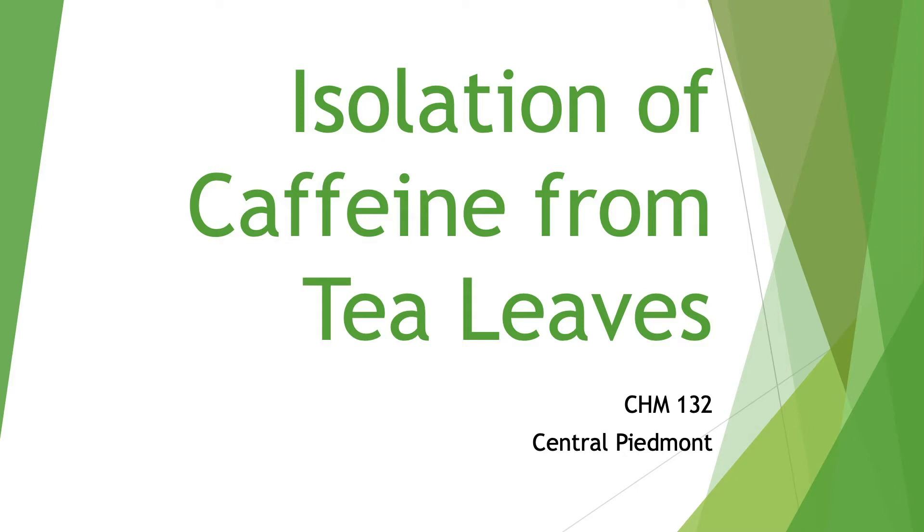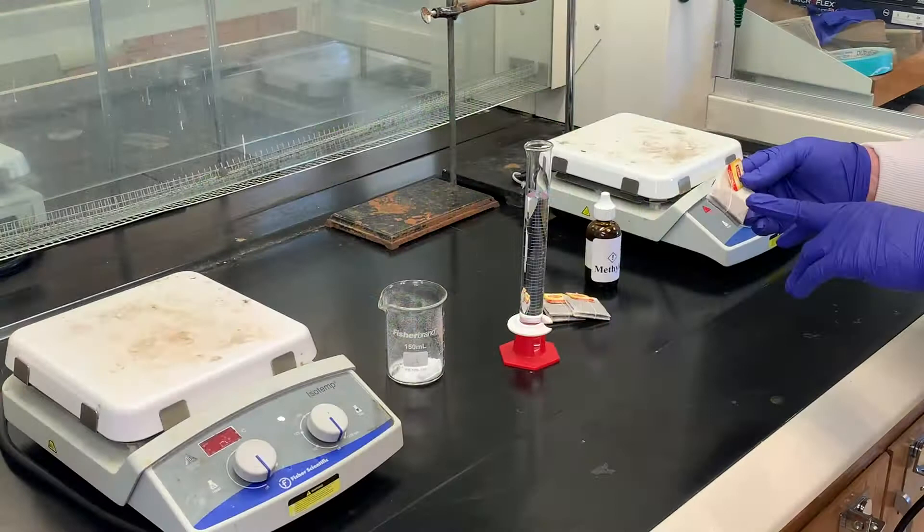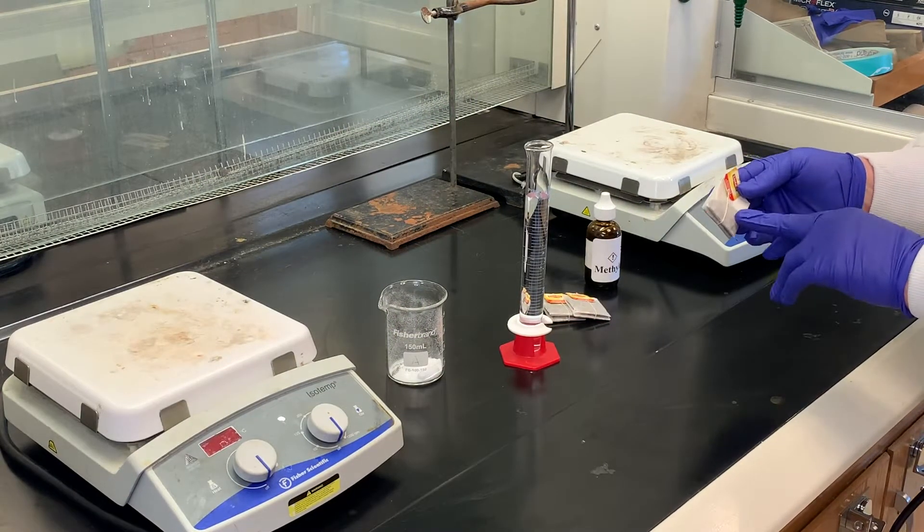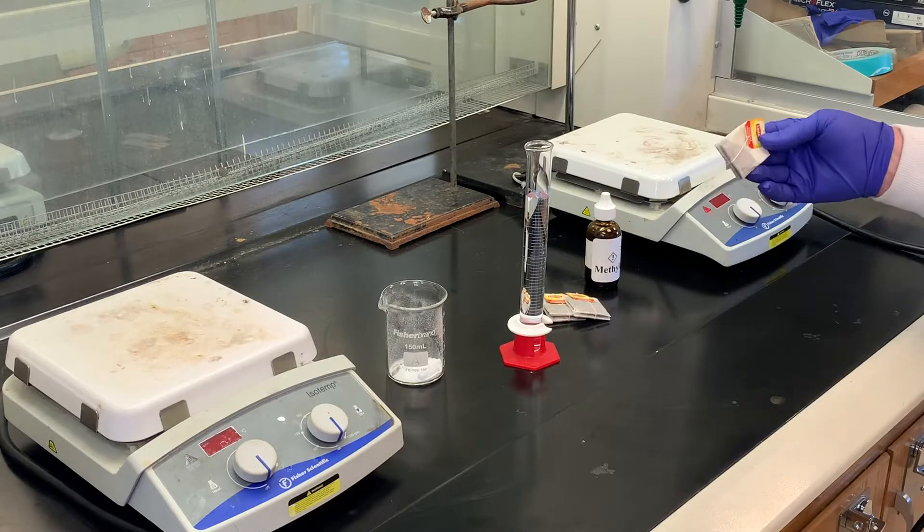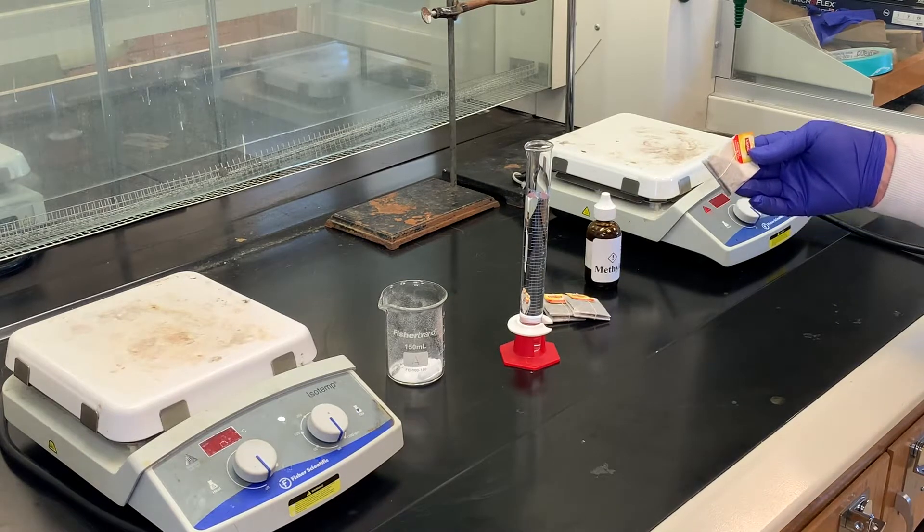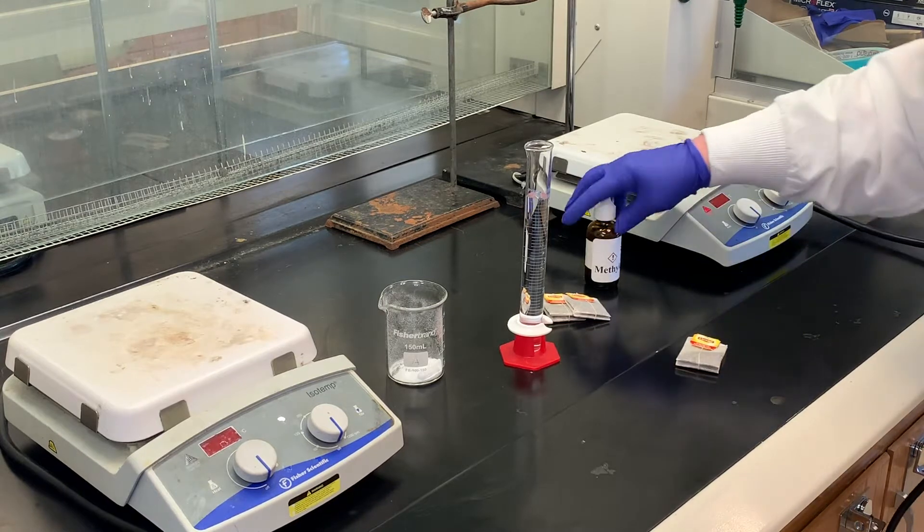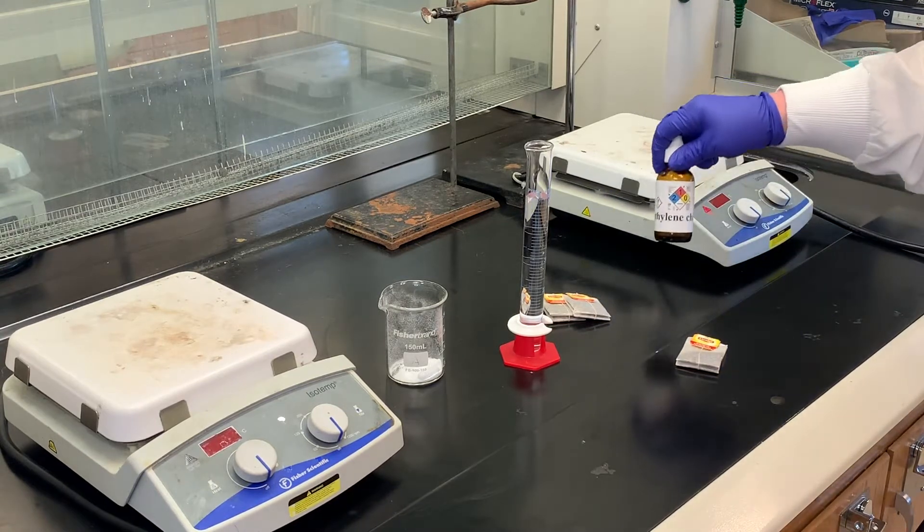Today's lab, we're going to extract or remove caffeine from tea. When we talk about the word extract, or extraction process in general, it's really a way that we can remove one component from a mixture—in this case, caffeine—and put it in another component. The other component that we're going to use is this solvent called methylene chloride.